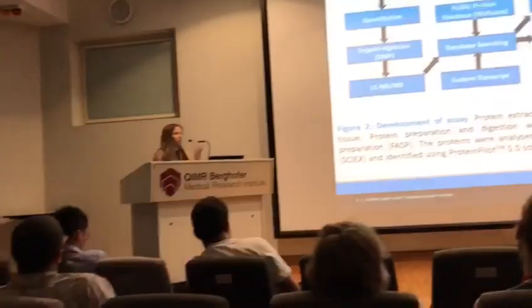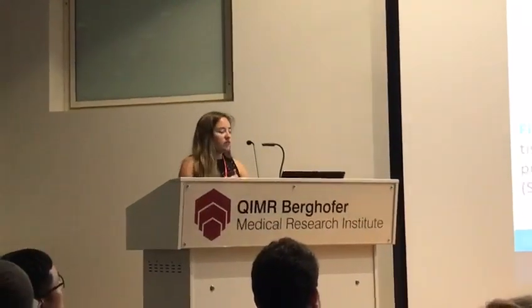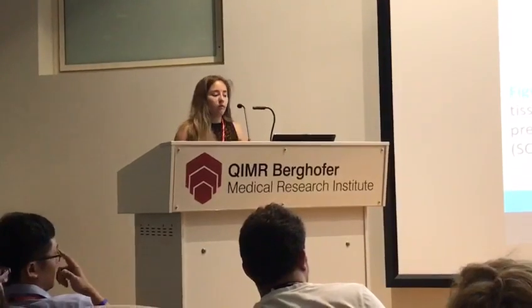As you all know, working with non-model animals is really hard in this field because of the lack of databases. So we had to build our own database, and we looked for all the proteins in public sources for mollusca, and we also found the transcript of Pomacea in an open source, and we built our database.